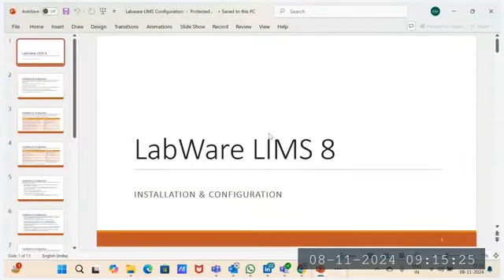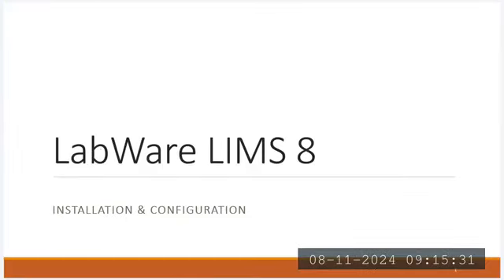I am taking a few examples of how these LabWare LIMS installations and configurations are going to happen. For your quick reference, I have some PPTs that I will walk through. But when we start our actual training sessions, we will be using the real-time application. But I want to communicate one more point.